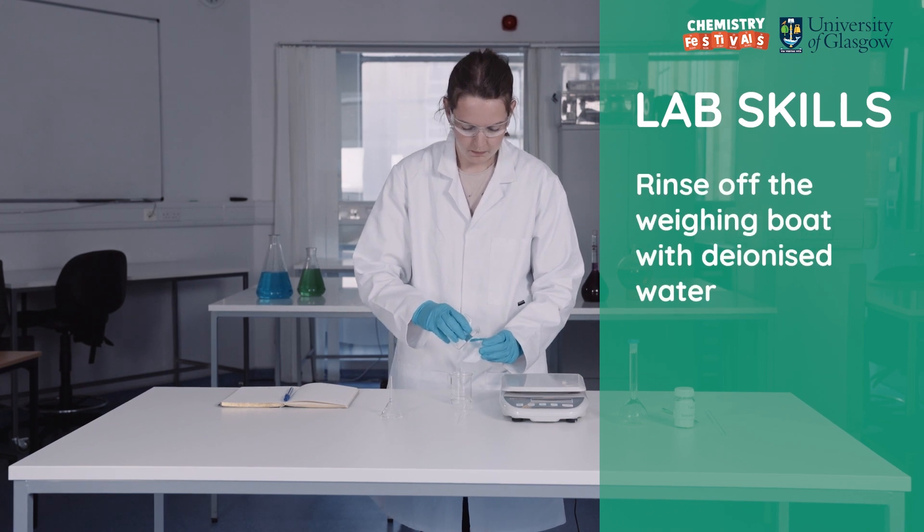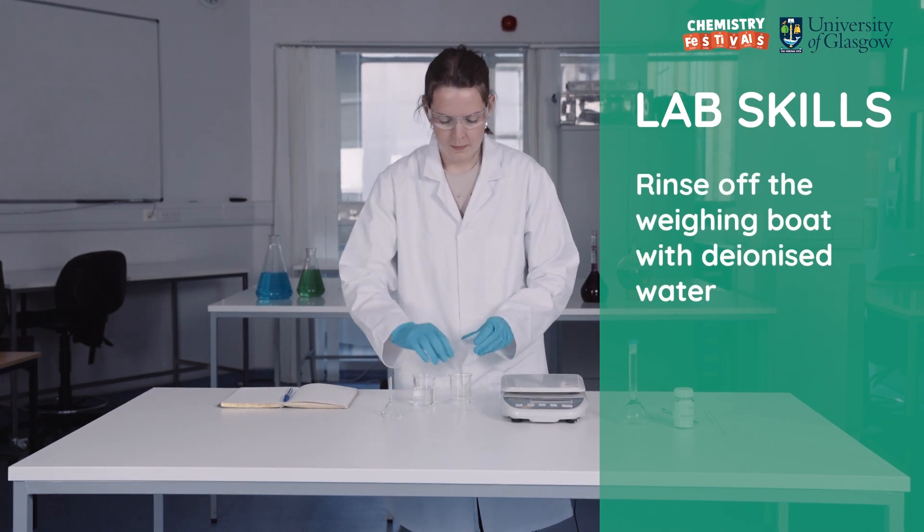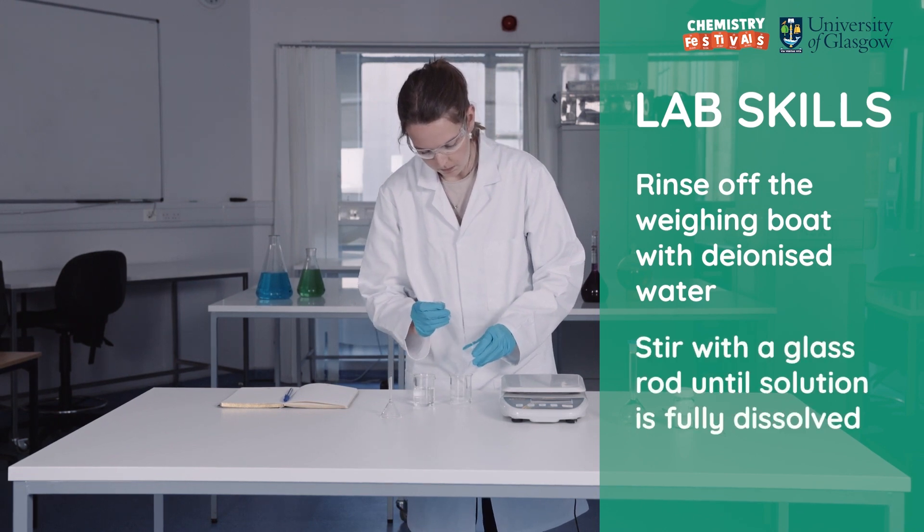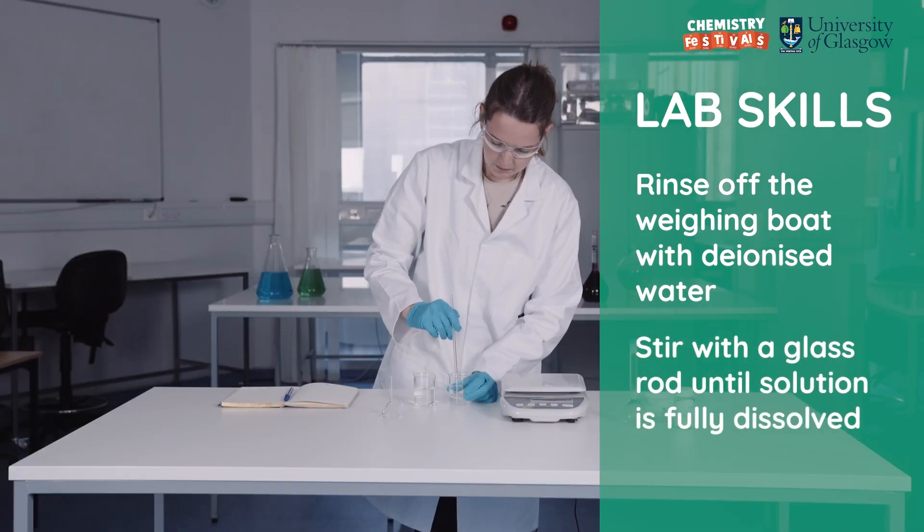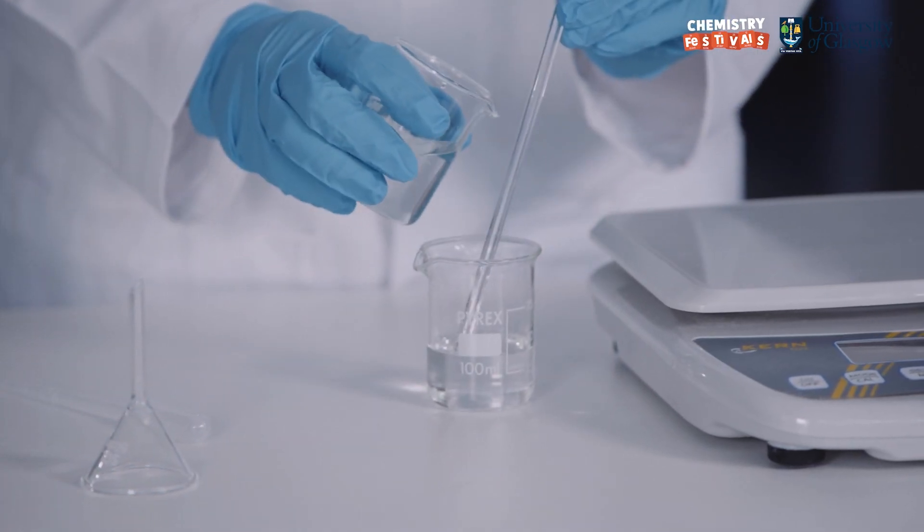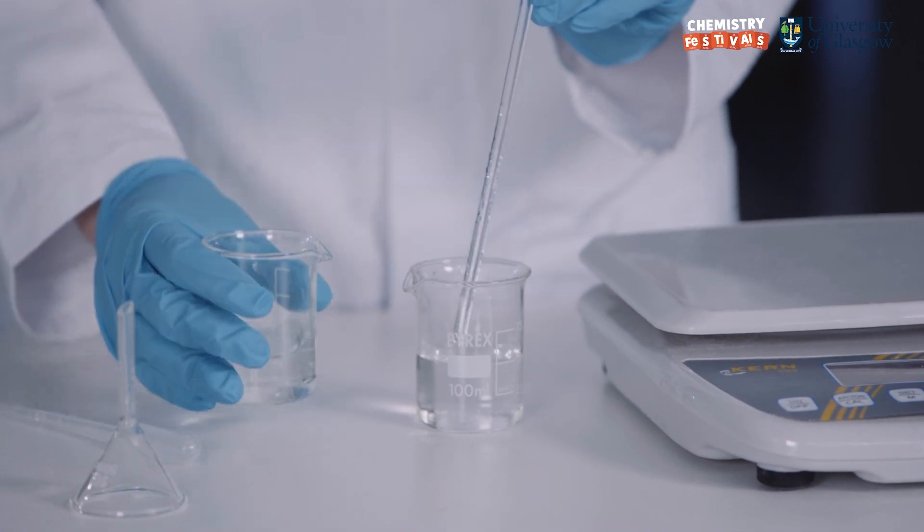Next I rinse off the weighing boat with deionized water. I add more deionized water and stir it with a glass rod until it is fully dissolved. If your chemical doesn't fully dissolve you may need to add some more water. Make sure to rinse off any excess chemical from the glass rod.